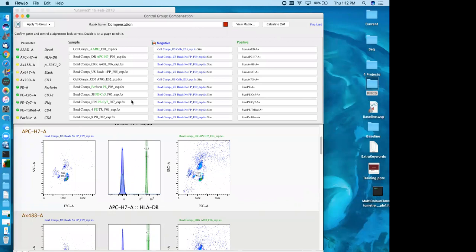Next, we go back and look at the name of the file to see if the parameter is listed in the name. In this case, it is. We see the little green highlighting, and we get the green go circle over here on the left. And at that point, that indicates that we're pretty confident we've picked the correct sample, that there's a peak in the matching name. Both of those things are awesome. That means that one's probably good.